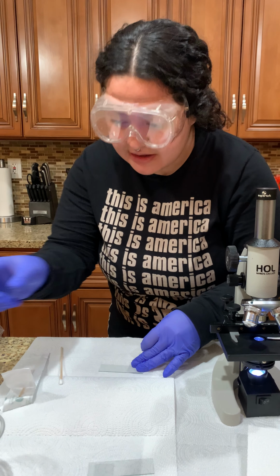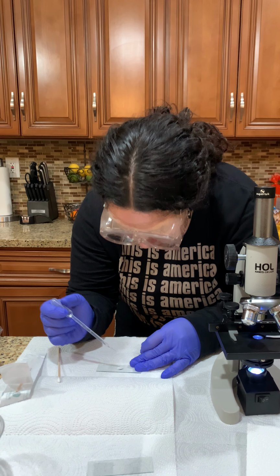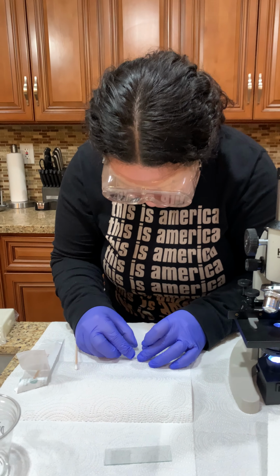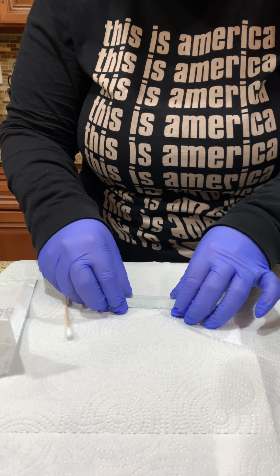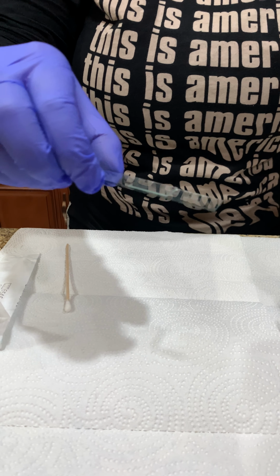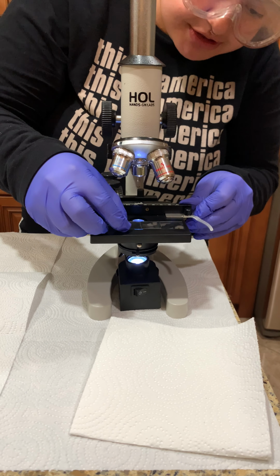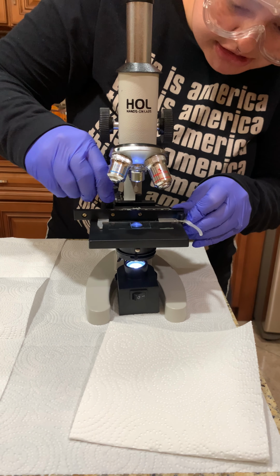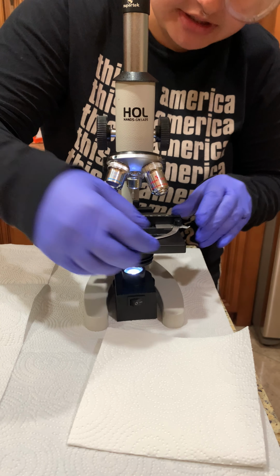I'll put that aside. I'm gonna get 1 drop of the distilled water. Okay, and then with my cover slip, I'm gonna go ahead and cover that. I'm gonna put on one edge, and it's gonna wick the whole bottom. Perfect. So I don't have any excess water. What I can do now is put this under my microscope. I'm gonna show you this part real quick. I'm gonna put it into my microscope. I'm gonna adjust the knob quick. And I'm gonna put the stage clip so it can hold it into place.